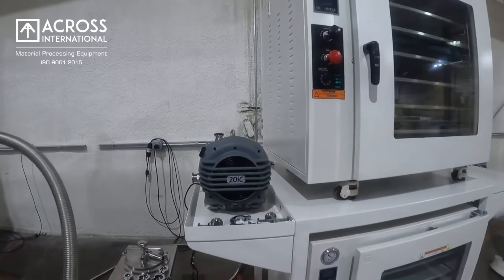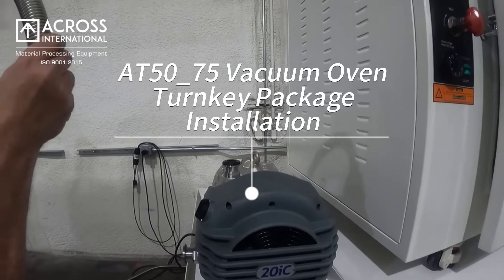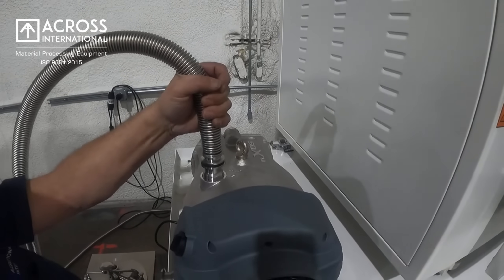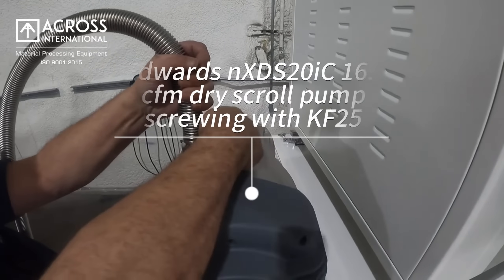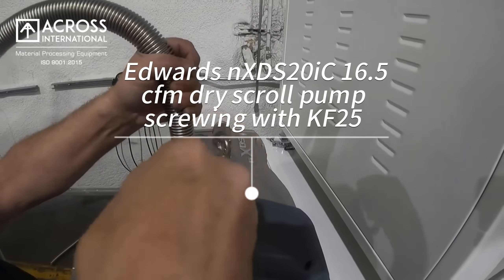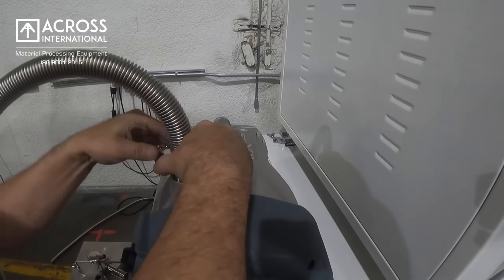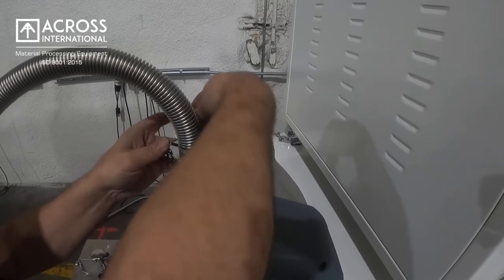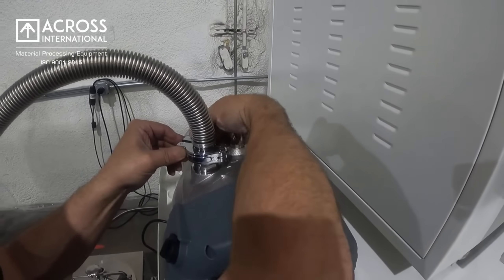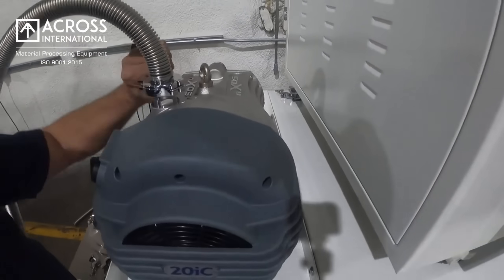Today we'll be installing a cold trap into two AT50 ovens. First we'll take our vacuum line to the top of our pump, secure it with a KF 25, ensuring that we have the seal. Tighten your clamp down.